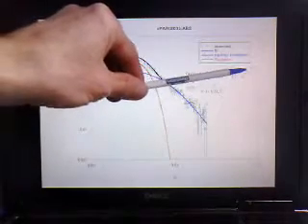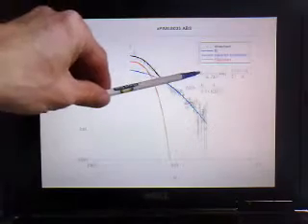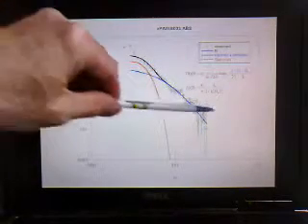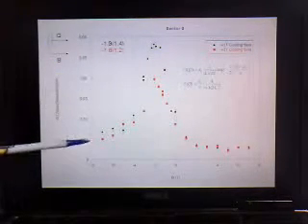So this value of A2, the centroid, is 0.03. And the value I constrained for the half width was 0.0015, and that was obtained from the presentation that I gave to you a couple of days ago. So I'll fit then the amplitude of the Gaussian, the amplitude of the Lorentzian, and the half width of the Lorentzian to these data, and I'll do that as a function of applied field. So these are the first set of data.